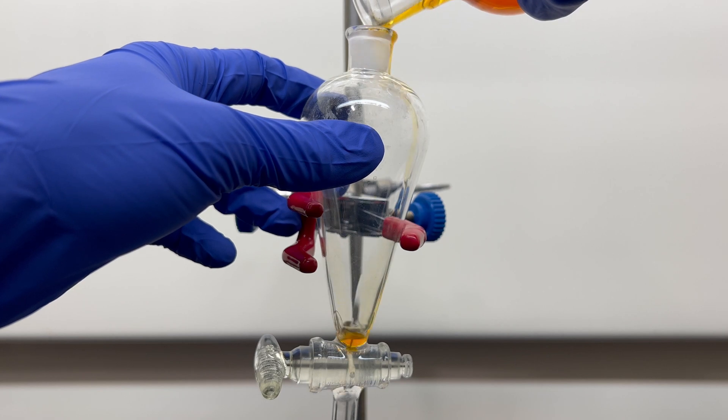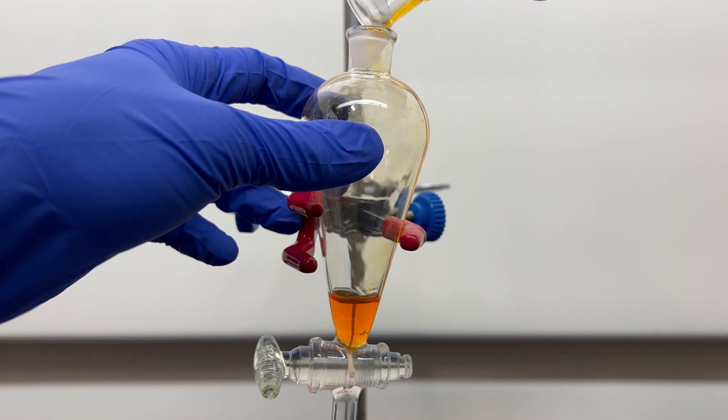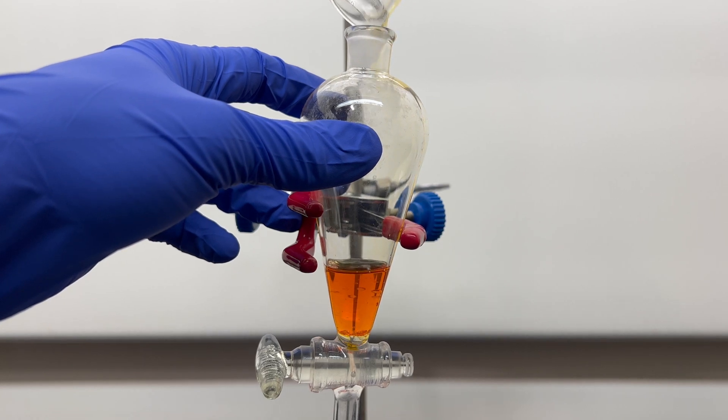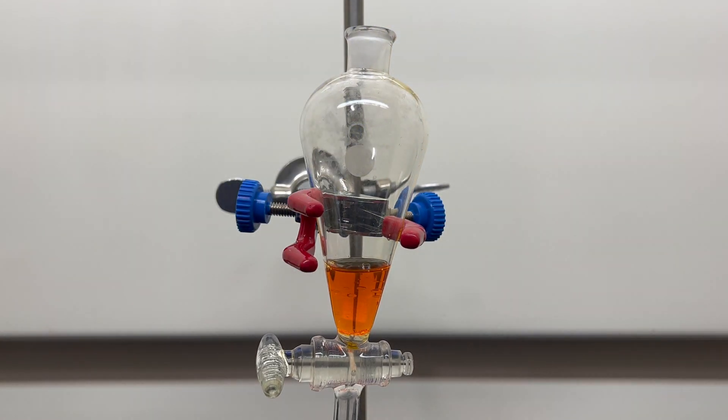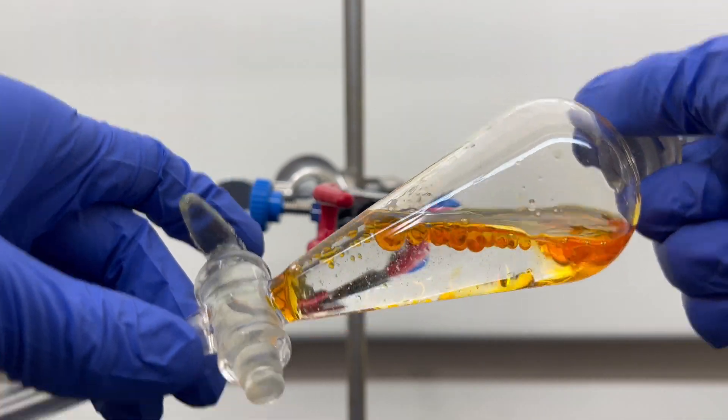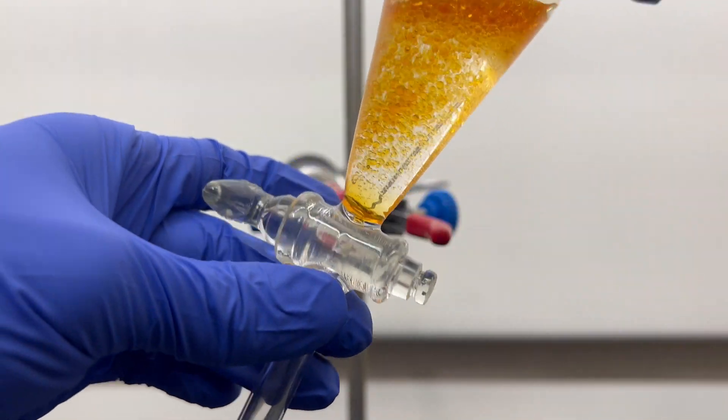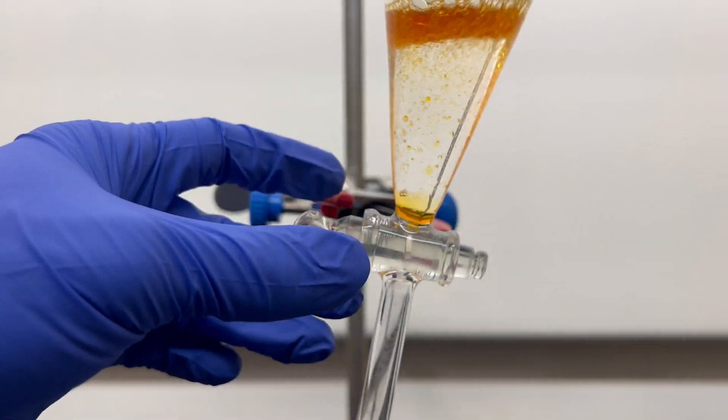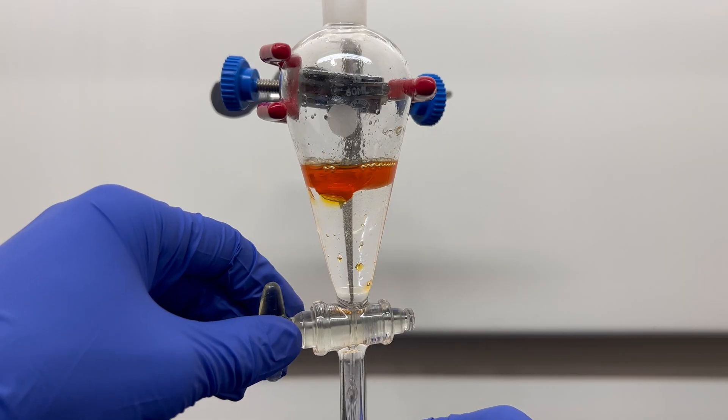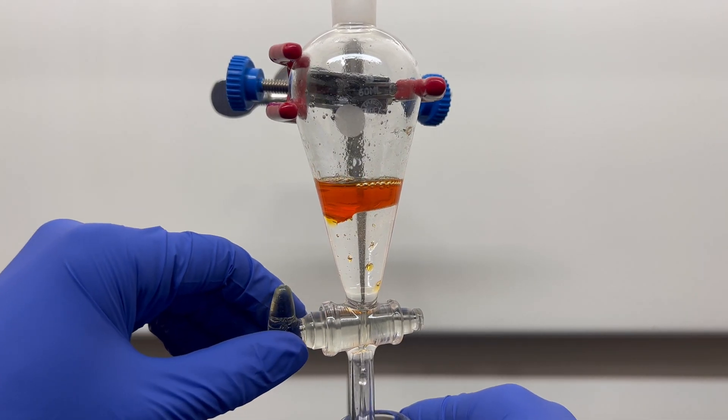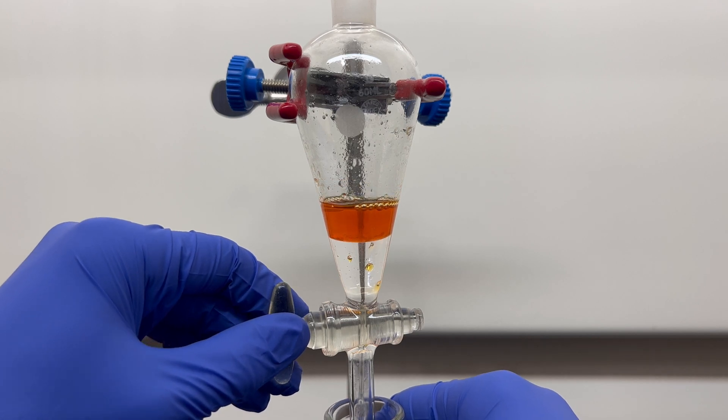The dirty liquid is then transferred to a separatory funnel to separate the water from the benzene. The benzene has a density of 0.88 grams per milliliter, so it's our top layer. We drain the water into a flask and the benzene into another. This step also serves to remove any water-soluble impurities.